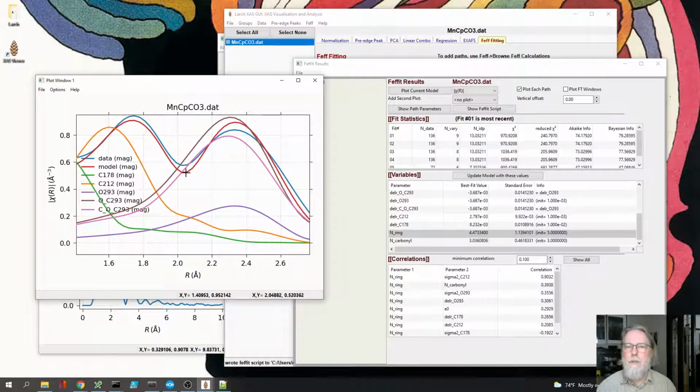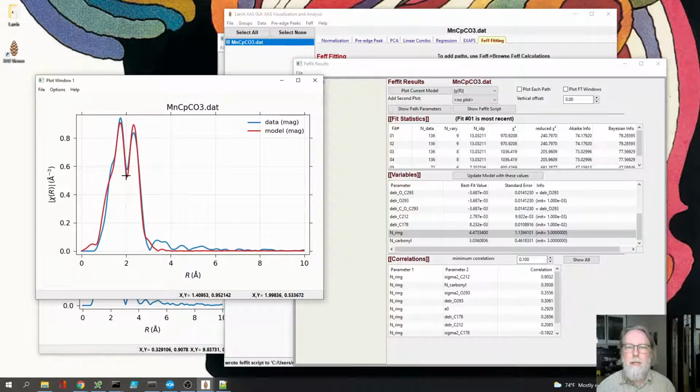They add sort of destructively there, and that's a good indication that the paths are not separate if it doesn't go to 0. So interpreting that simple dip as meaning that's where there are separations of paths is probably wrong and going to lead to the kind of crazy results and E0 values of 20 volts that we saw for the first fit that we did with this data set.